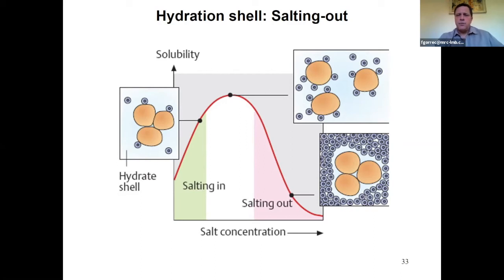Although on the bottom right figure, which represents precipitation, there's no water molecule around the sample. You still have some hydration though, even when the sample precipitates or crystallizes.